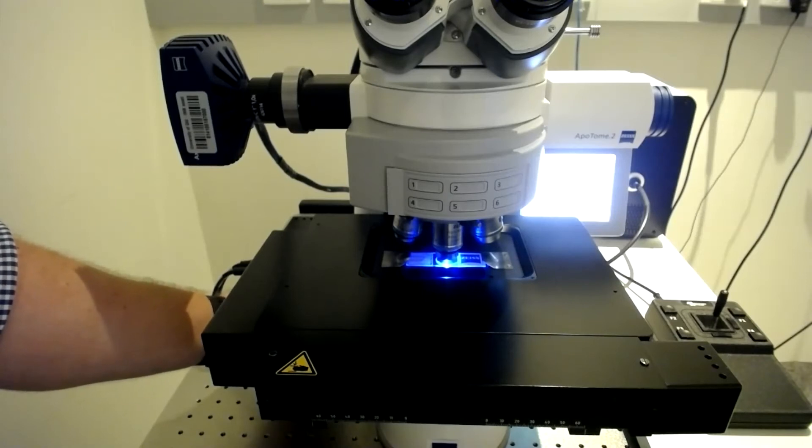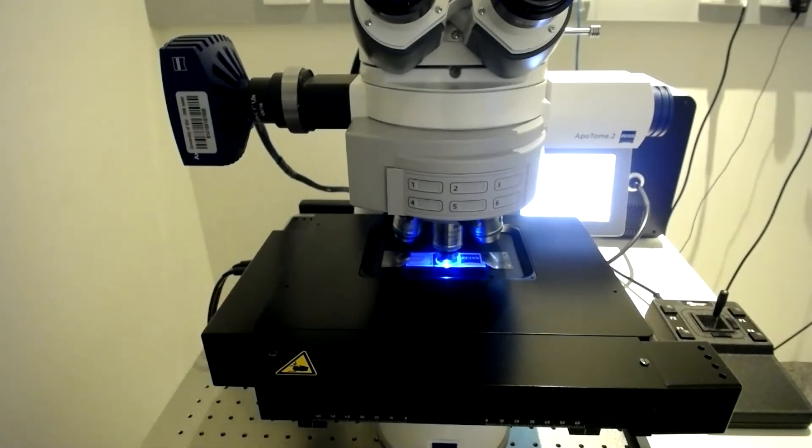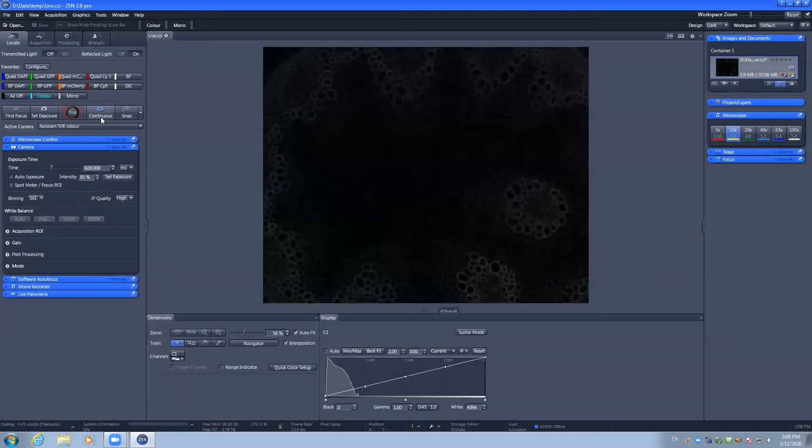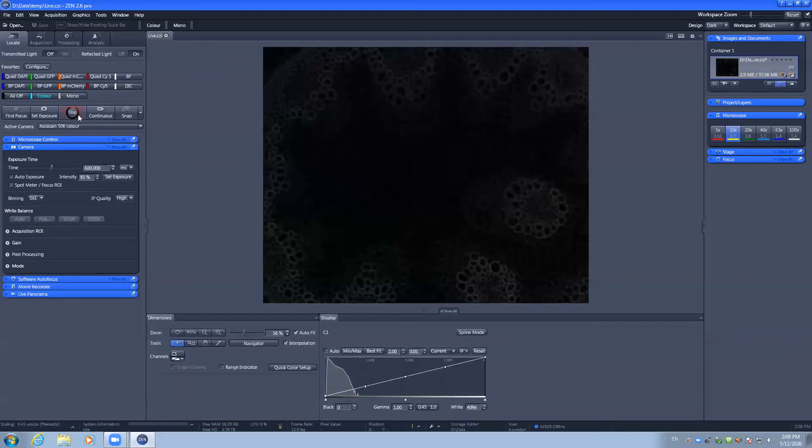From herein, the training will be a screen capture of the software ZenBlue and how to view and capture your sample. Once you have found your sample and you can see it through the eyepieces, you can use the live camera feed on the screen so that you can see your sample is in focus.